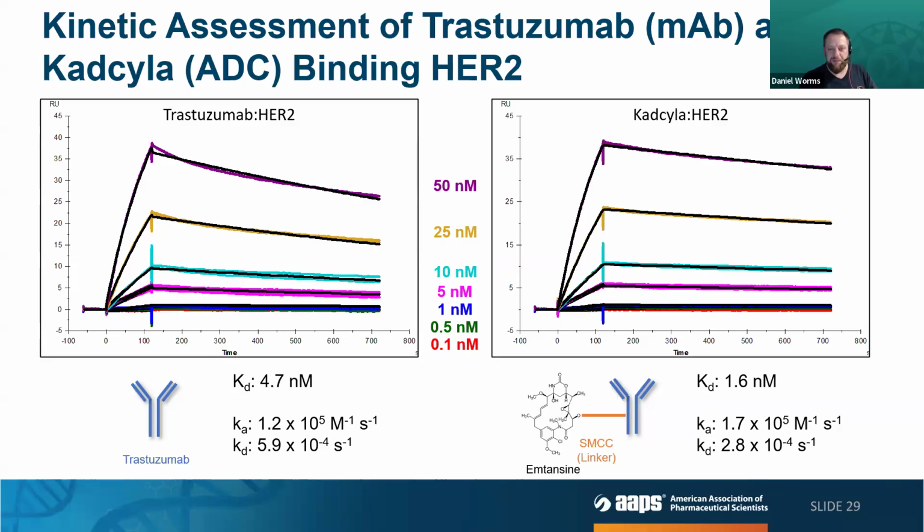So here in this example, we also performed a kinetic assessment of both modalities. And interestingly, the association rate constant ka is quite similar between the two modalities, though the association rate is a little bit faster for Kadcyla.